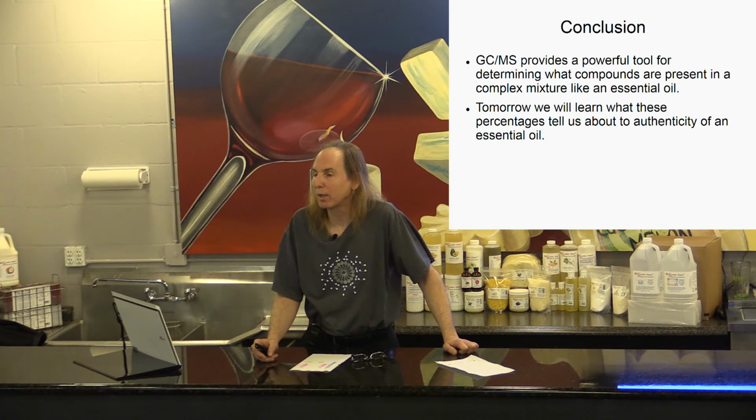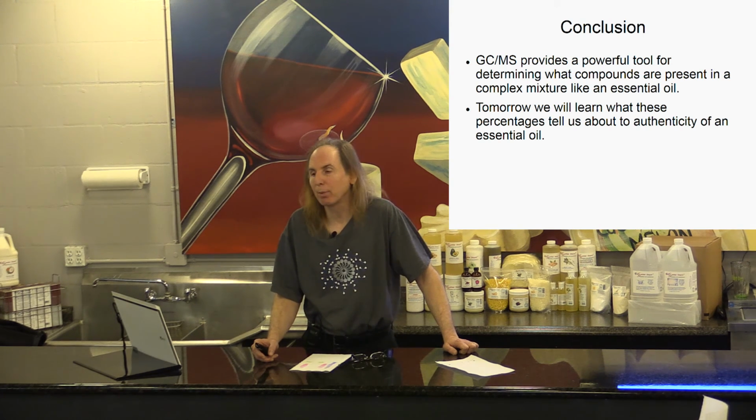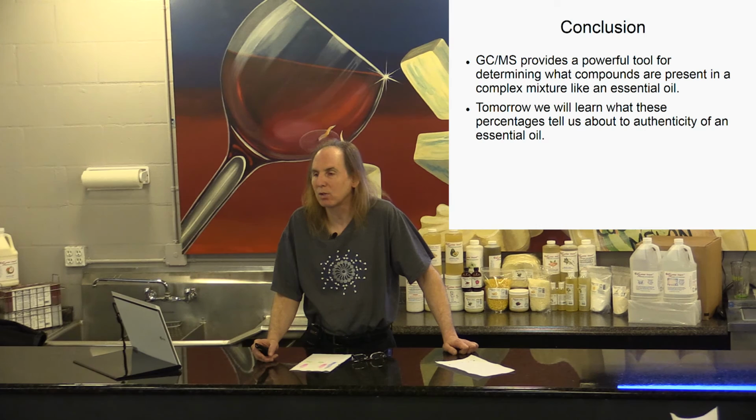Which one has the greater affinity for the water? Blue or purple? The blue had a greater affinity for the water. The purple had a greater affinity for the paper. They moved at different rates. So what looked like 1 ink is separated into at least 2.